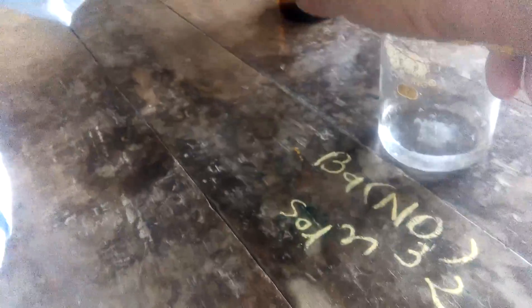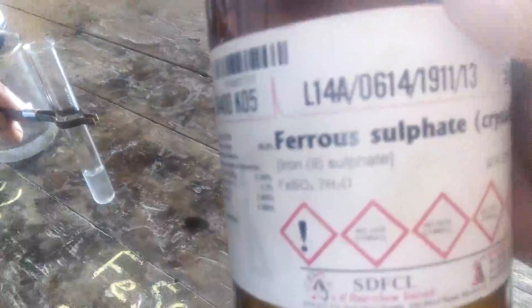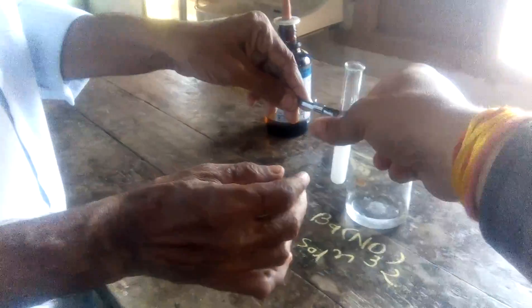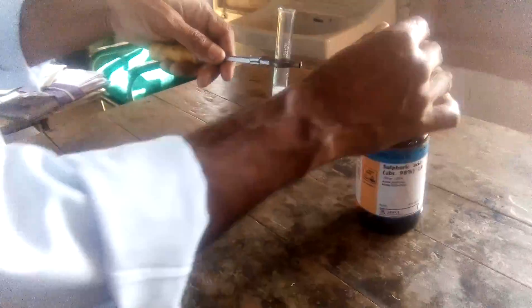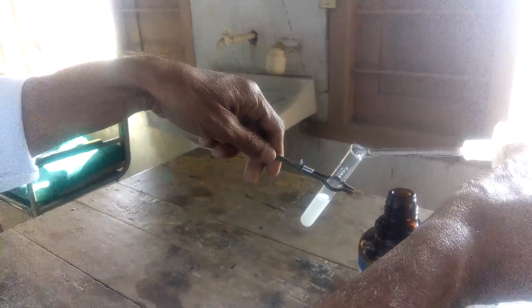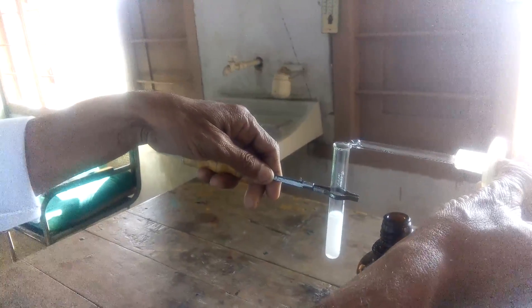Now let's see the test in reality. This test is performed by Jagdish Parmar and Ashish Thakkar. First, add barium nitrate solution into the test tube. Now we add freshly prepared ferrous sulfate solution into the barium nitrate solution — it is converted to a white precipitate. Now we add concentrated sulfuric acid slowly into the test tube.